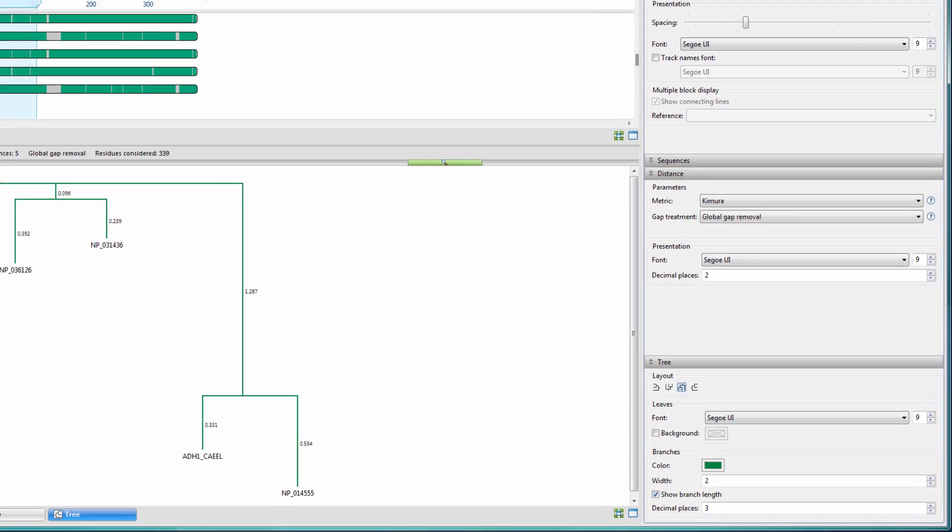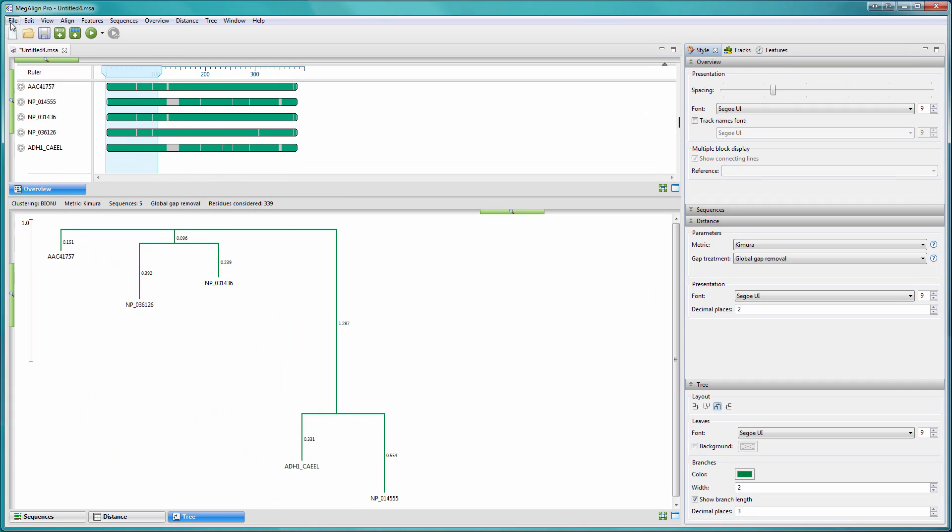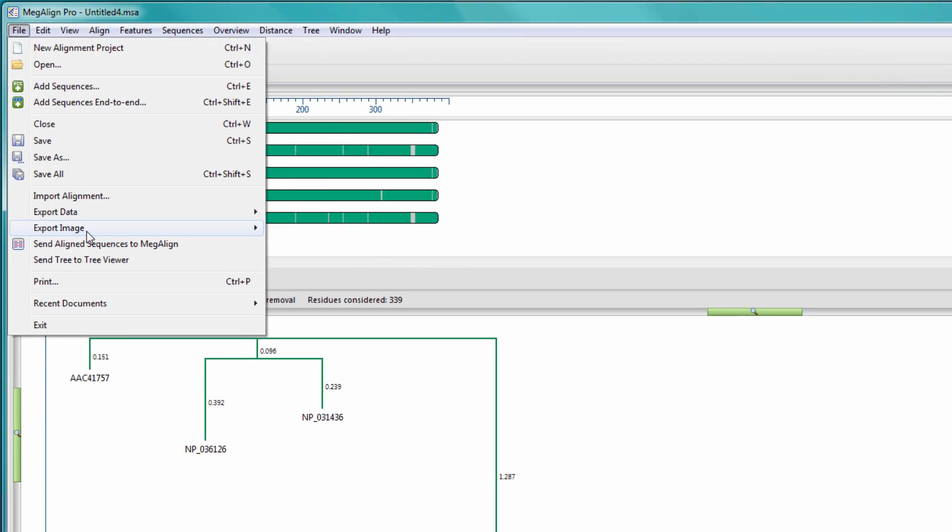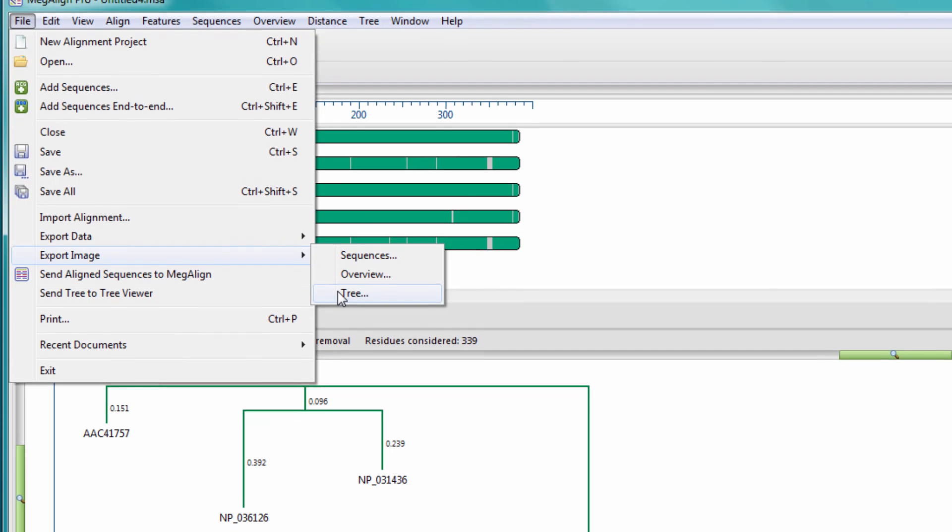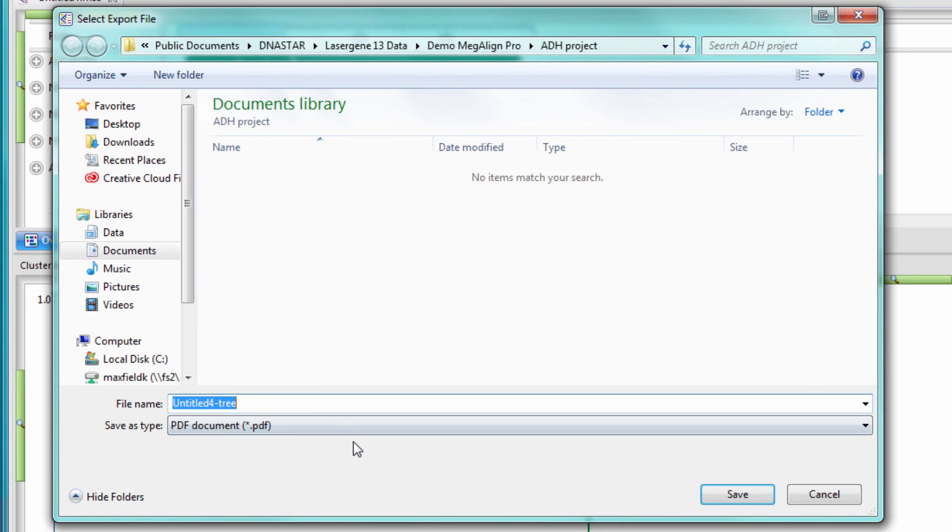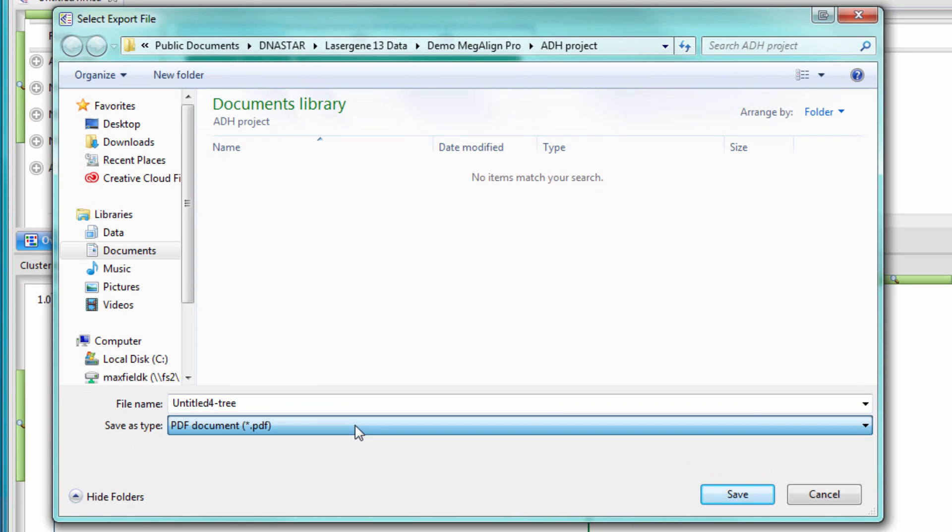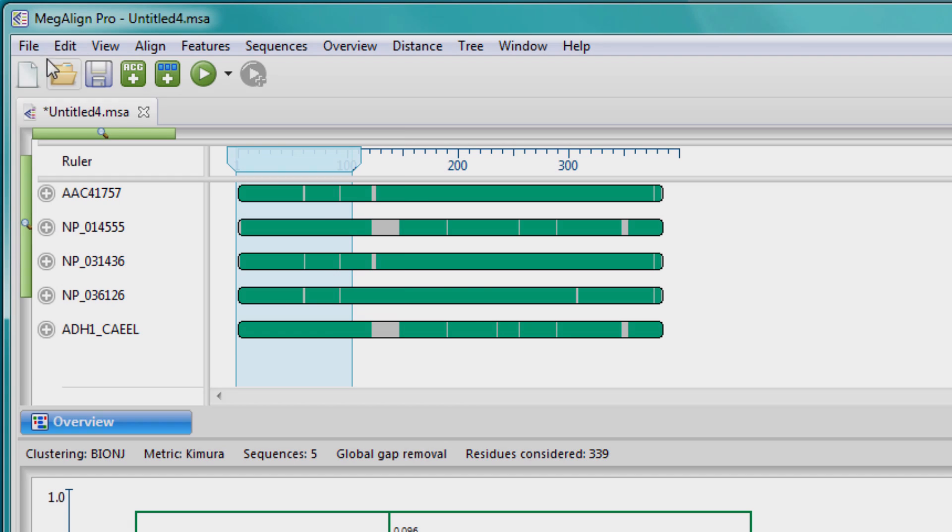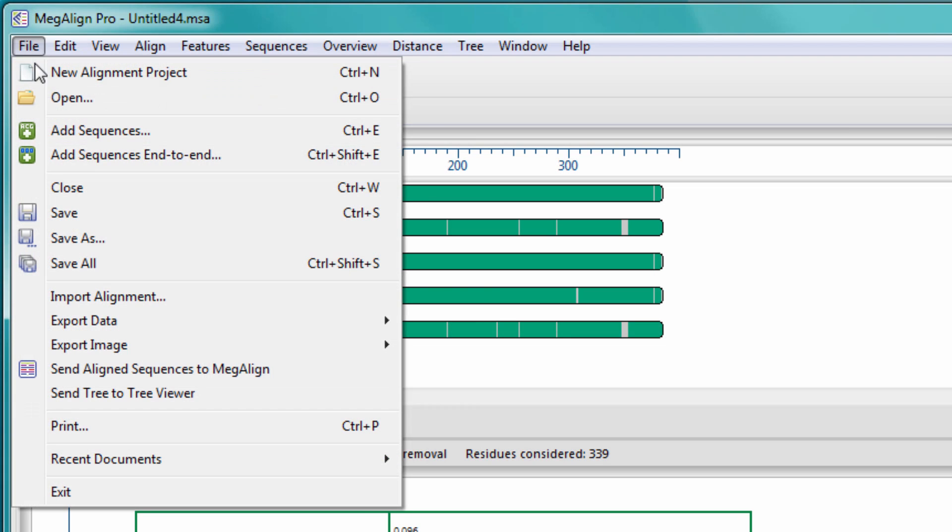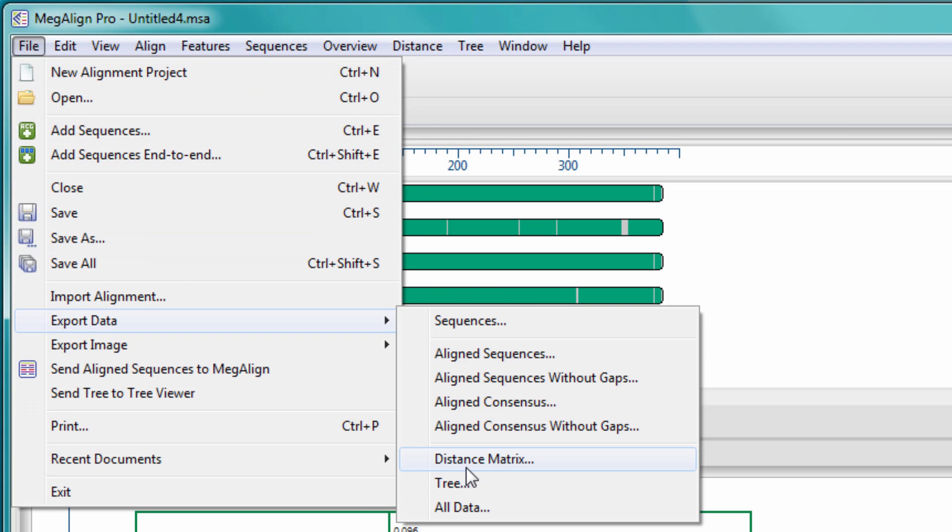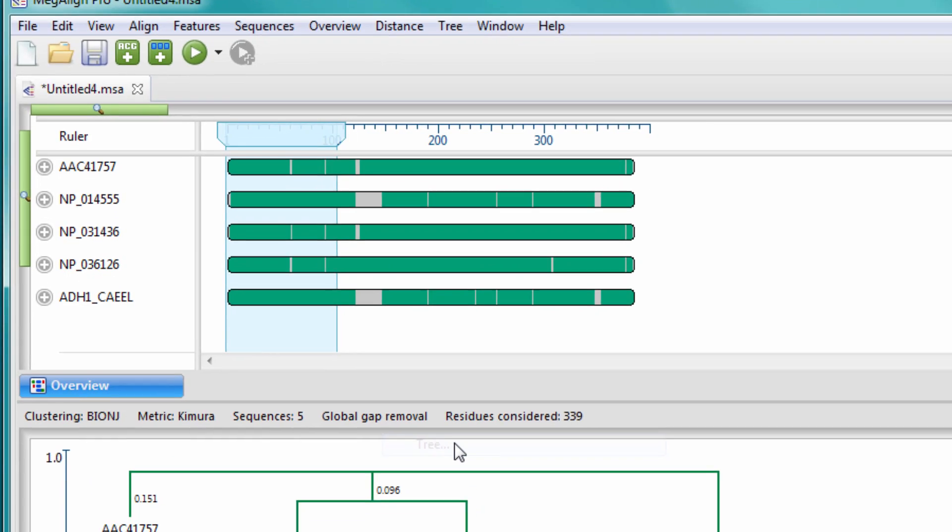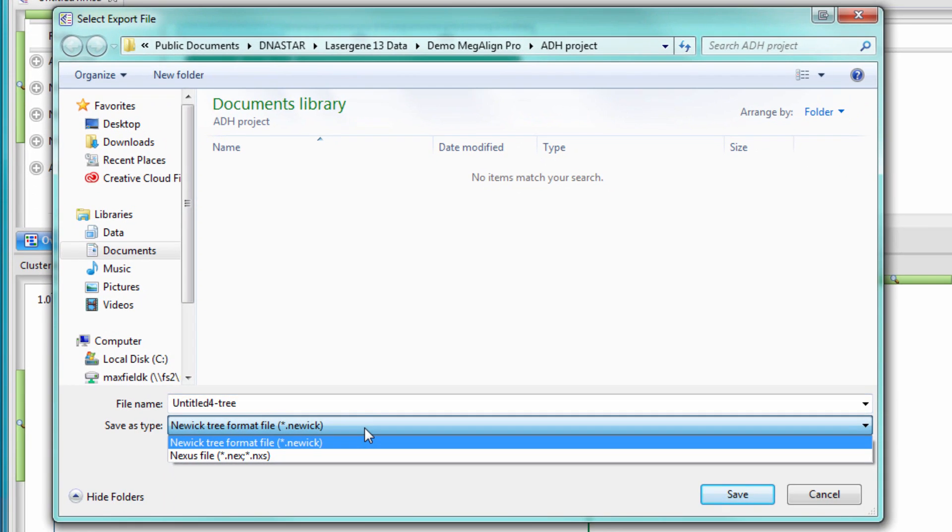You can then export an image of your tree in PDF, JPEG, or PNG format. You can also export tree data in NUIC or Nexus format to be opened in another tree viewer.